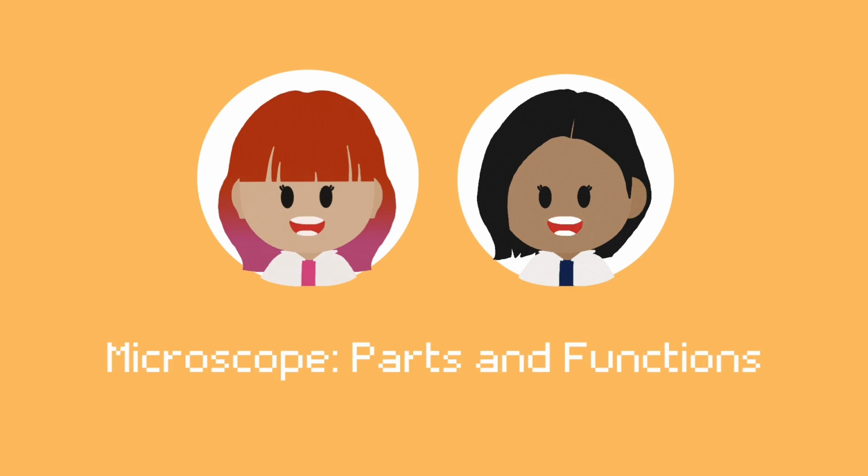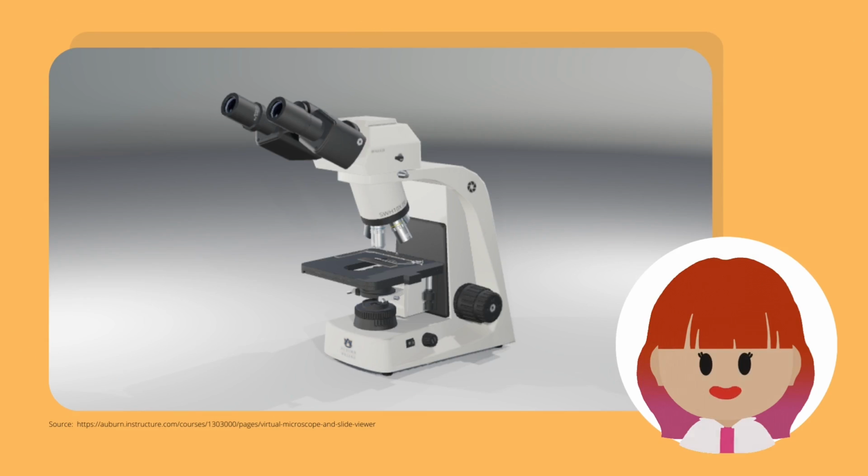Now, let's learn more about the microscope. Let's call in Jana and Den to talk about it. Hello, we'll be introducing the parts of the microscope and its functions. We'll be starting from top to bottom.